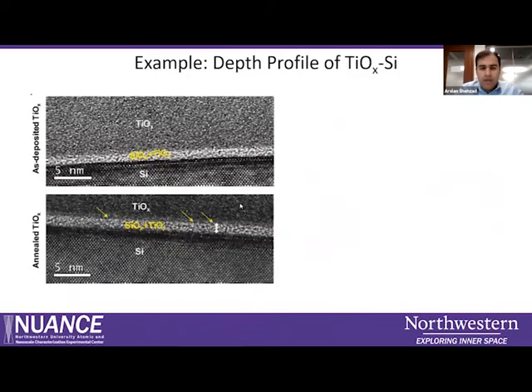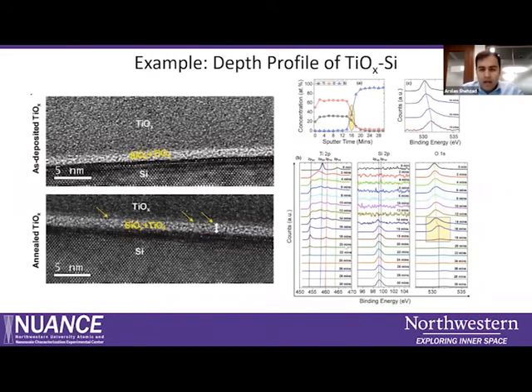With that, there is an example here, from the literature, which confirmed how this depth profiling can be used to see elemental analysis or layered structures. This is not a particular example for a 2D structure, but for 3D layers, like for example here, silicon with a silicon oxide layer. And then you can even distinguish the interface from one layer to another. So here, you can see a very in-depth analysis, which can confirm a transition from titanium to silicon. And there is a shift which confirms the silicon and titanium oxide presence in this perspective. And similarly for the titanium, you can actually clean off all the titanium from the surface.